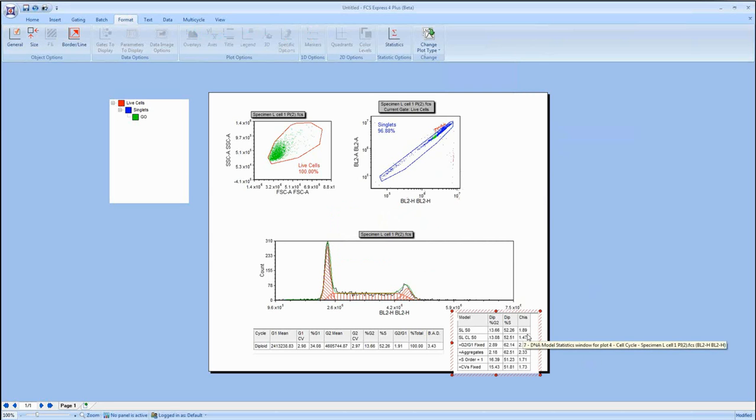And what this shows us is the 6 different multi-cycle models. So if you have the full version of multi-cycle, you can choose which of the 6 models for fitting that data makes the most sense. Normally, somebody would choose the model that has the lowest chi-squared value for that data. And with this model summary statistics, you can actually compare all these side by side.